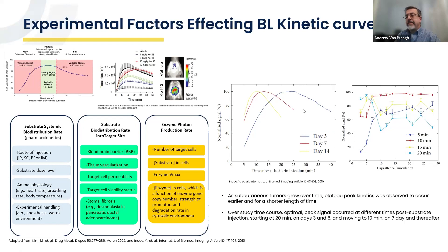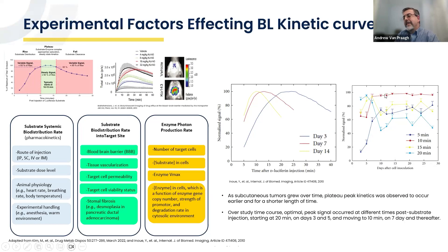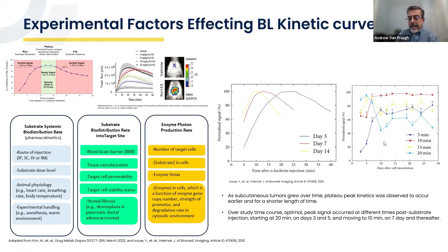If one was not aware of this and simply used a fixed time point for measuring bioluminescent data, the optimal data would be missed. For the first few days of a study, you would want to measure at 20 minutes to get peak kinetic data. However, as the time course progressed, the actual optimal time point for measurement would shift back to around 10 minutes. So the optimal measurement time point for getting peak kinetic data can vary even within a single study's time course.